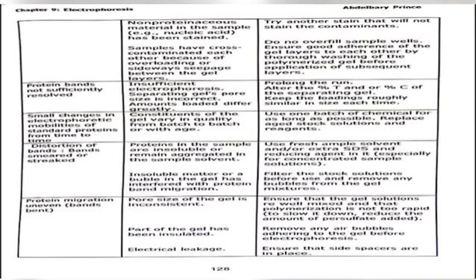Problem: protein migration uneven (bands bent). Cause: pore size of the gel is inconsistent. Remedy: ensure that the gel solution is well mixed and the polymerization is not too rapid; to slow it down, reduce the amount of persulfate added. Cause: part of the gel has been insulated. Remedy: remove any air bubbles adhering to the gel before electrophoresis. Cause: electrical leakage. Remedy: ensure that the side spacers are in place.